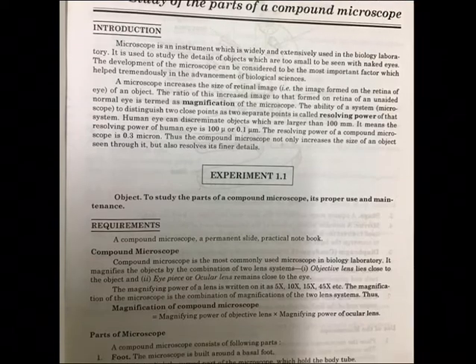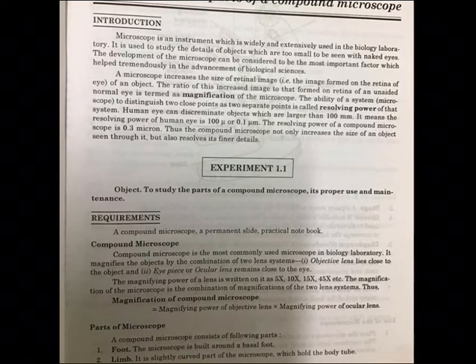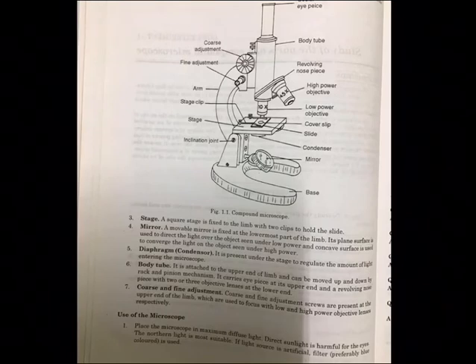So what are the parts of the microscope? A compound microscope consists of the following parts. All these come under description, mind you. First, the foot: the microscope is built around a basal foot. Second, the limb: it is the slightly curved part of the microscope which holds the body tube, as you are seeing here.